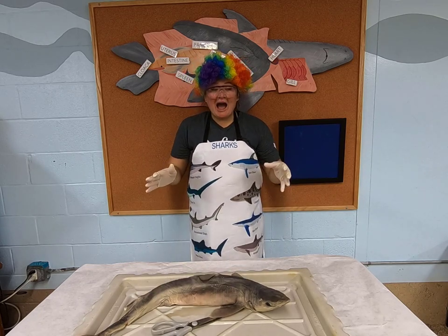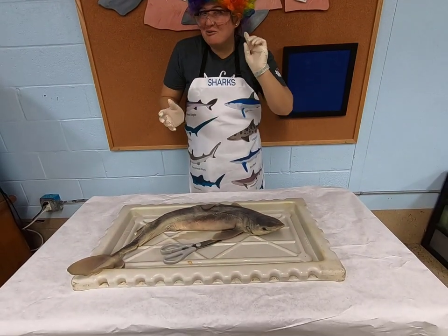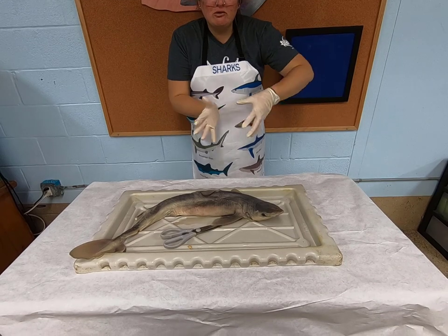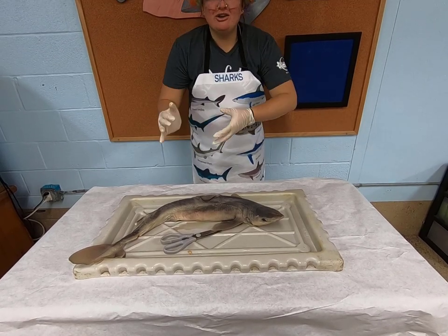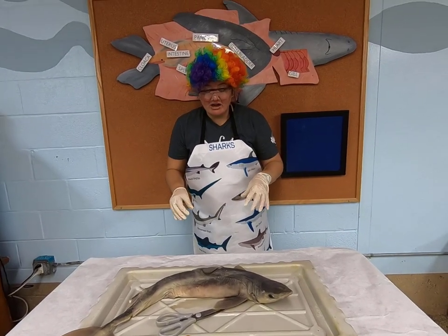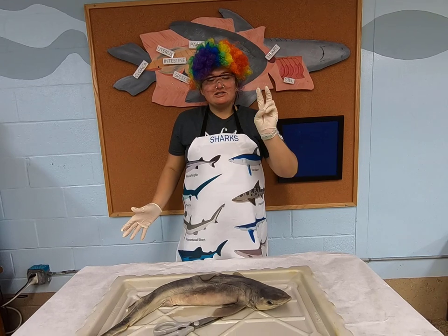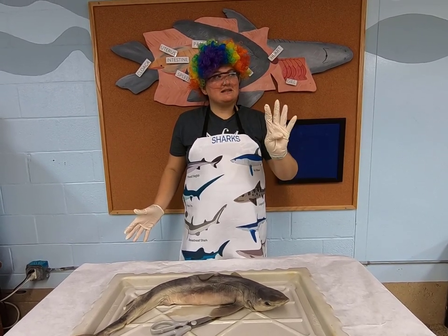Schools of fish will have this as well, this lateral line system, and along with their inner ear, it allows them to move through the water all together in unison. So it's really cool, this sense of touch that they do have to feel the movement of the water around them.